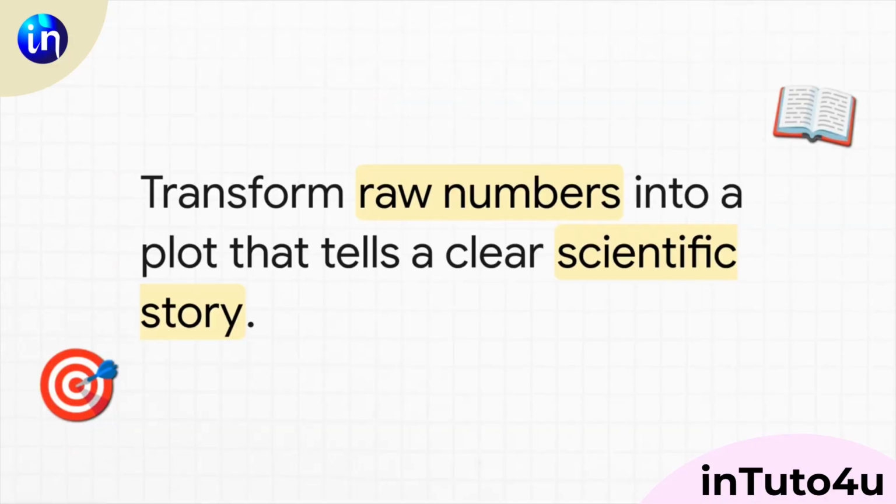So this right here, this is our main mission. We want to transform that boring list of numbers into a clear visual story. We're trying to create a plot that lets anyone, your colleague, your professor, even a journal reviewer, look at it and instantly get the science. That's where the real power is.